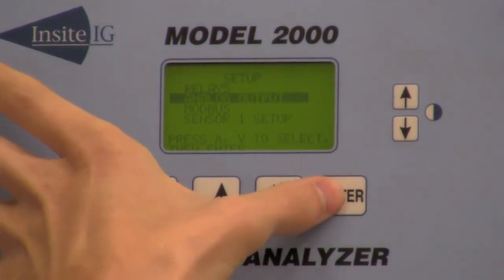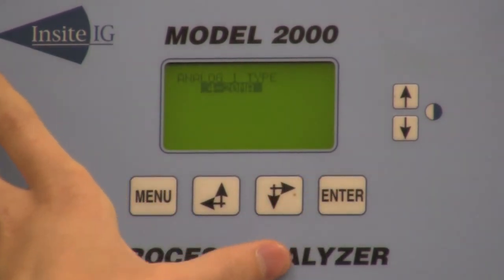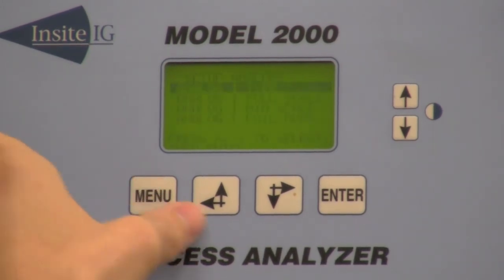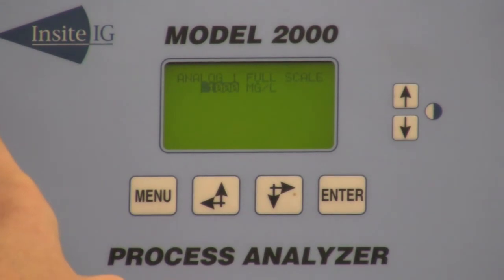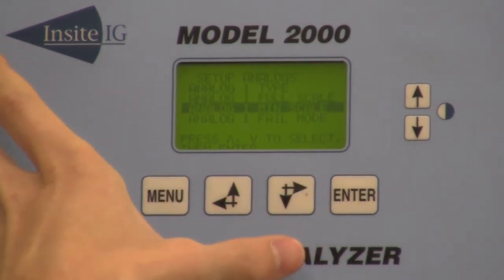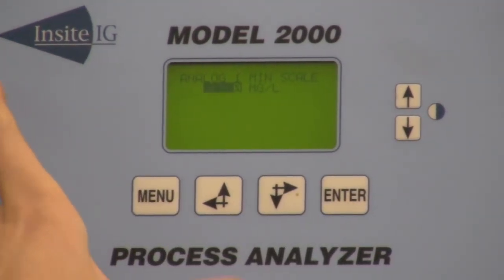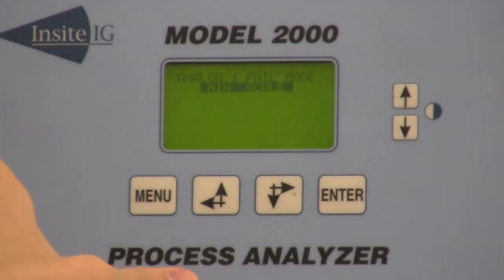Then you're going to set up your analog output. You have your analog type, which you can choose 4 to 20 or 0 to 20 milliamps. Then your analog full scale, which you can set to whatever you choose for your process. Then analog minimum scale, which is always going to be set to zero.